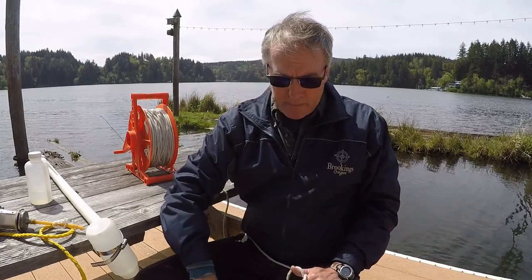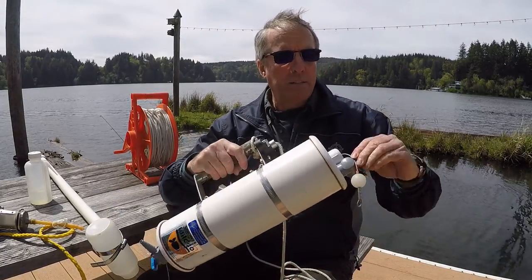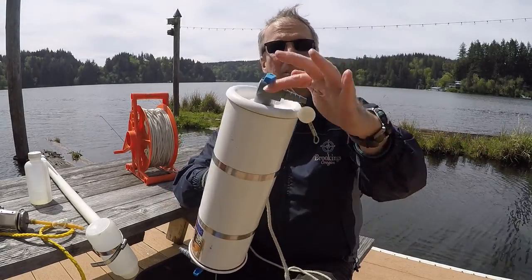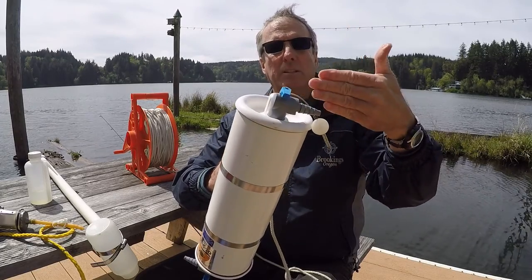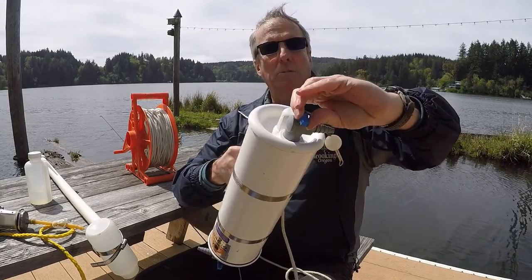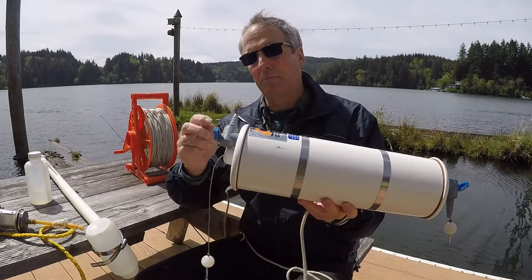So after this gets up to the top, what do you do? This is all full of water now. As you can see, there's a couple of stopcocks on the bottom of it, and before you send it down, you need to make sure that the stopcock is perpendicular to the spout. If it's aligned with the spout, it means that it's open and going to be able to drain out. If it's closed, it means it's locked, and it's like shutting the valve of your water sink off.